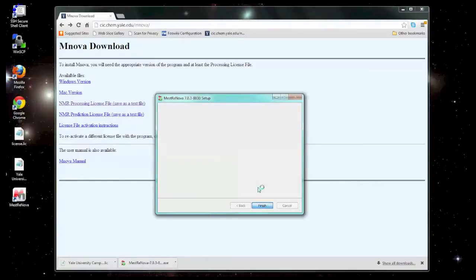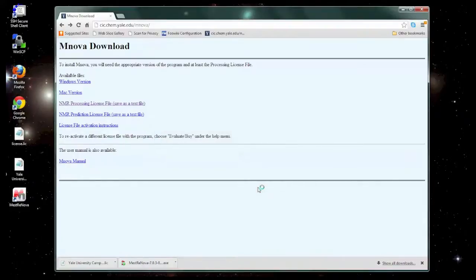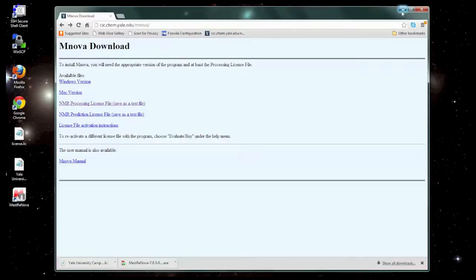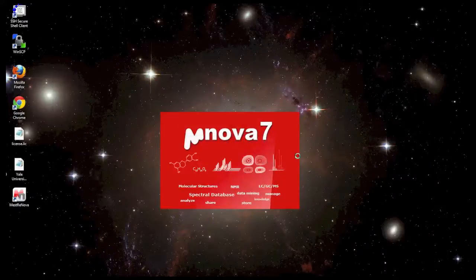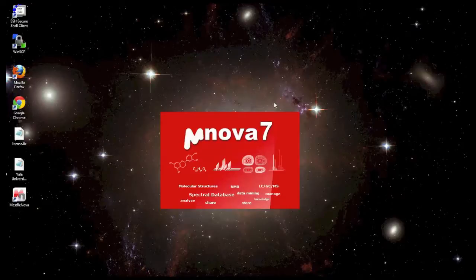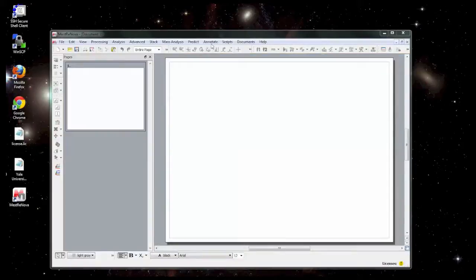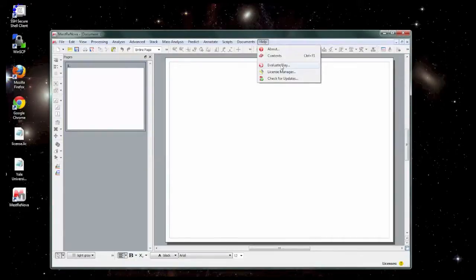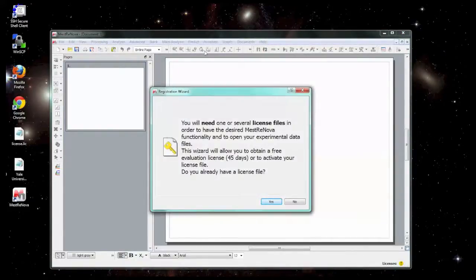We're going to start the program. Often, first time you run it, it should automatically pop up with the window that will tell you to activate the program. It may take a few minutes here to open the first time. If it doesn't, another way you can get to the window is to go to help, Evaluate/Buy, and then you'll see this registration.